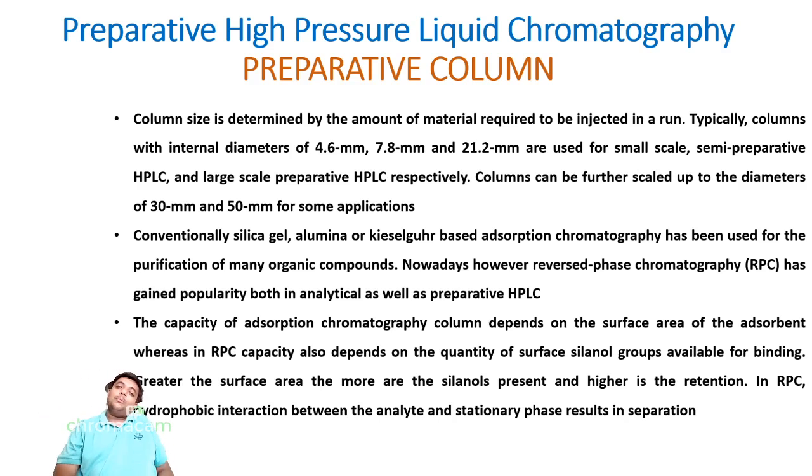So in reverse phase chromatography, hydrophobic interaction between the analyte and stationary phase results in the separation. So remember very well that hydrophobic interactions play a very important role when it comes to the chemistry between an analyte and a stationary phase.